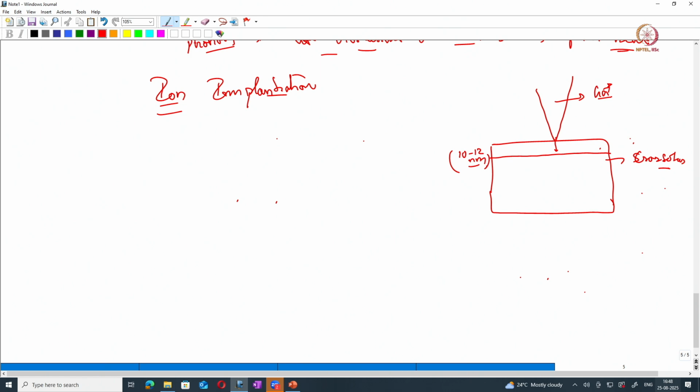However, in the case of electrons, it is mostly around 1800 to 2000 nanometers. So electrons can travel much farther into the sample, but the gallium interaction is around 10 to 12 nanometers. In this surface, there will usually be gallium implantation, because some of the gallium ions lose energy and stay in the sample surface.